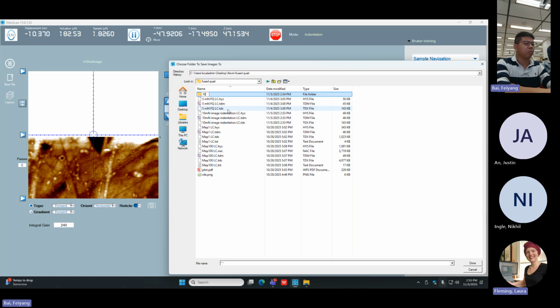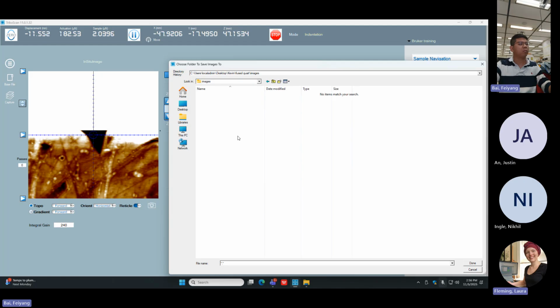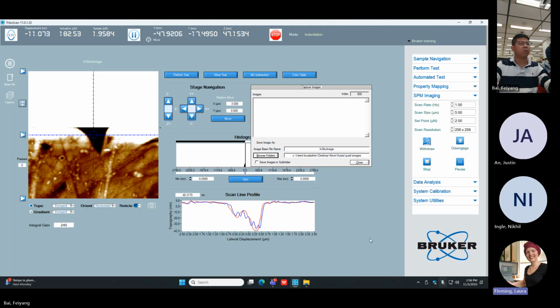Oh, no, sorry, not the folder, my apologies. You can leave that as images. Click back into there. And then click done here. And here, sorry, there's this image base file name. Right now it's just called in situ image. So let's go ahead and rename that. Yep, sorry, my apologies.